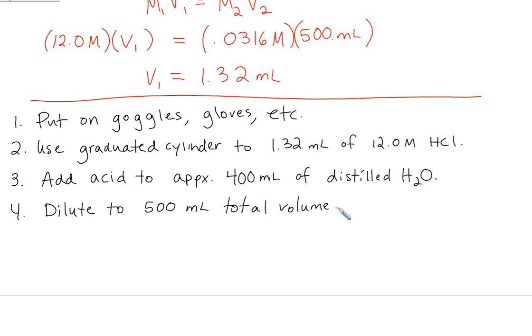When you make acidic solutions, especially from a concentrated acid, when you put that acid in the water, it's very exothermic. It releases a ton of energy. So if you just had your small amount of acid and you start putting in water, sometimes you'll see that water start to bubble right away. It almost boils. It fizzes and bubbles and it gets super hot.